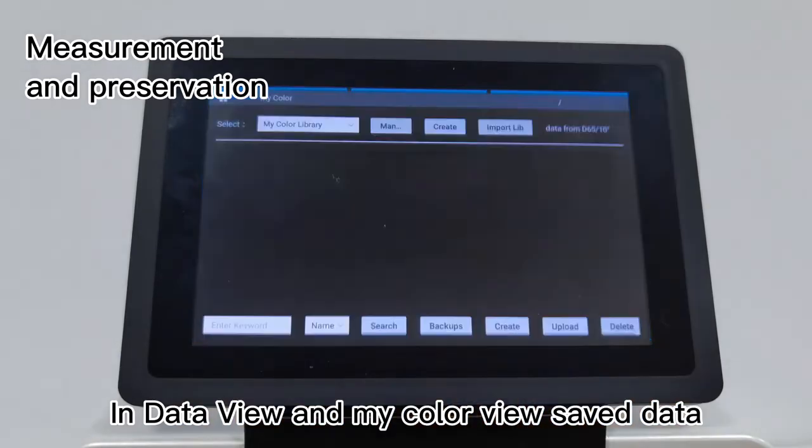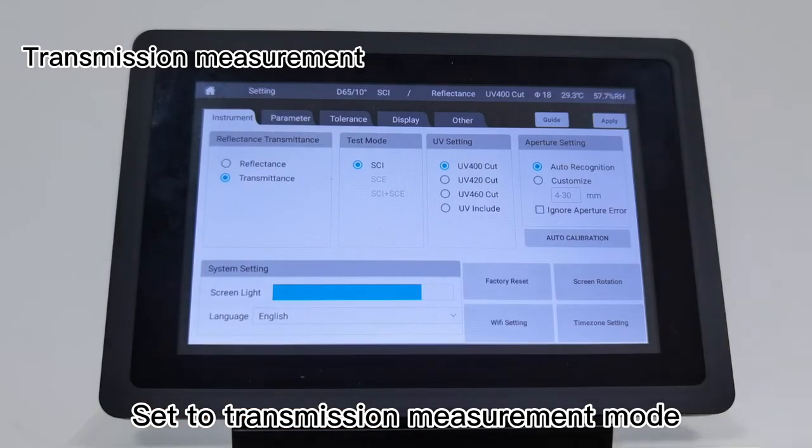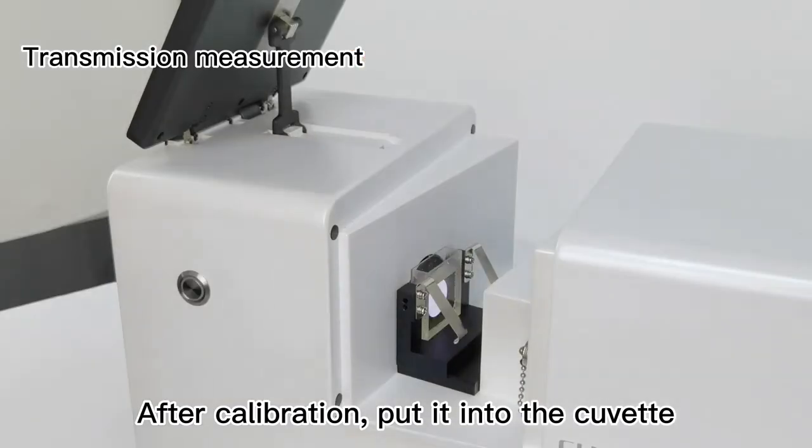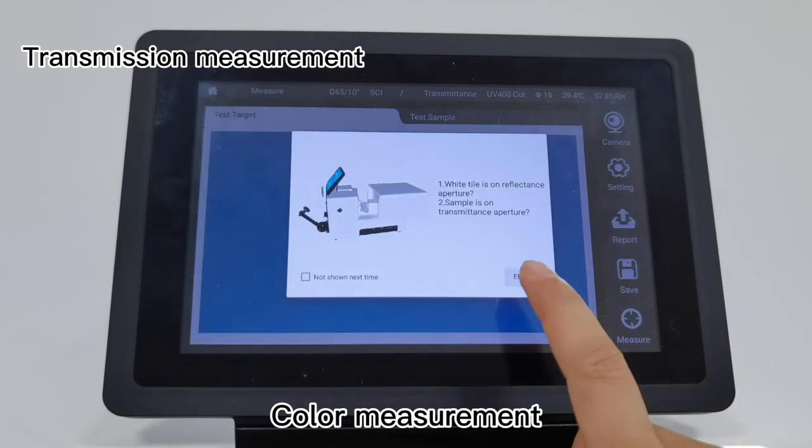Transmission measurement: Set to transmission measurement mode. After calibration, put it into the correct position for color measurement.